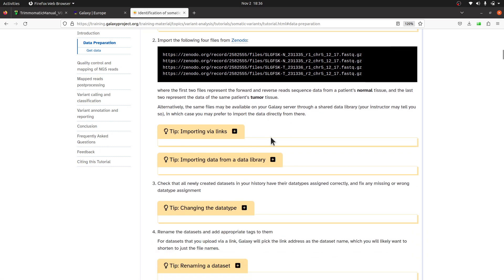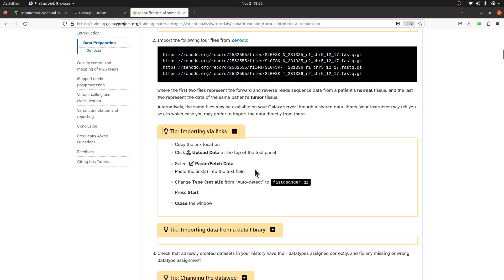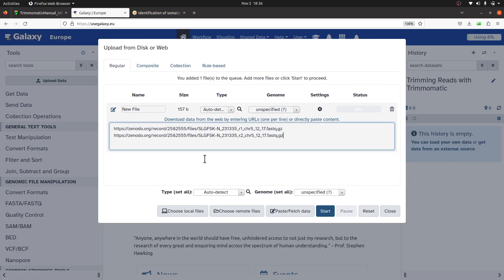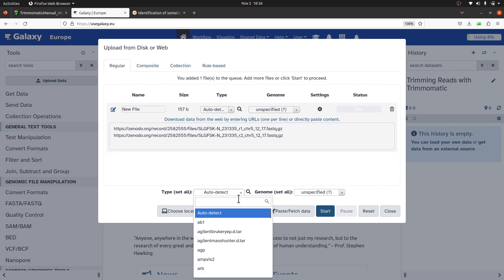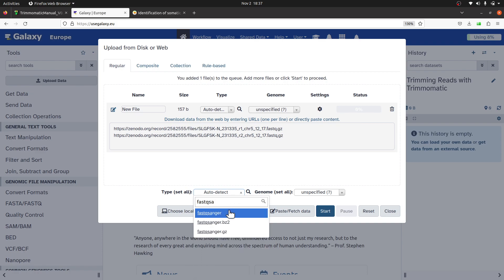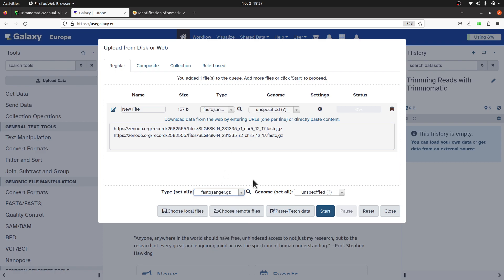Let's look at the instructions again on that same page. When you are there, scroll down and it says — under the tips — to change the type from auto-detect to fastqsanger. We will do this as well. Get back to the platform where it says auto-detect, click the type field, and you can type 'fastqsanger'. It will show all file types with that name, and we have fastqsanger.gz — select it.